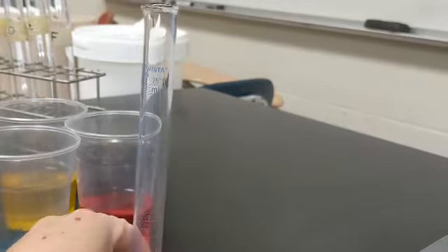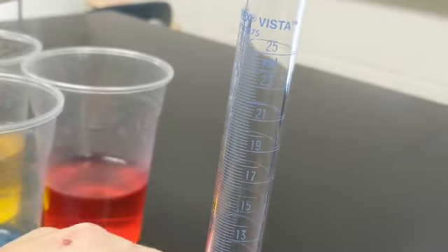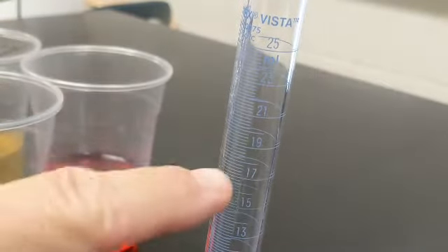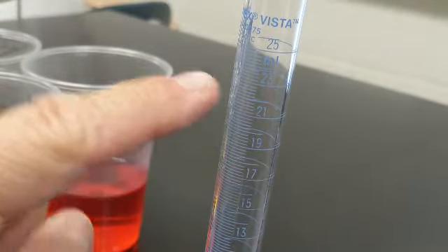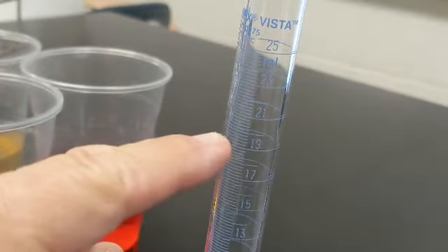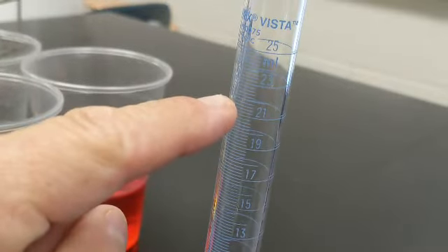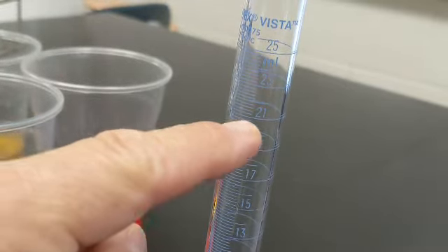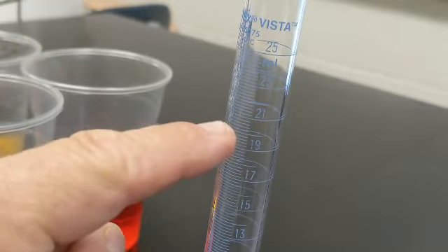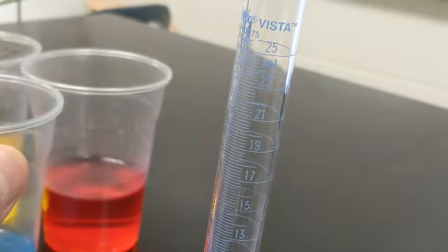This is a graduated cylinder. This is how we accurately measure liquid volume. And you'll notice that there are markings on the side of the graduated cylinder. The numbers represent milliliters of volume. So we've got 19 milliliters here, and we've got 21 milliliters here. So in the middle, that big line, even though there's no number associated with it, represents 20 milliliters of liquid volume.